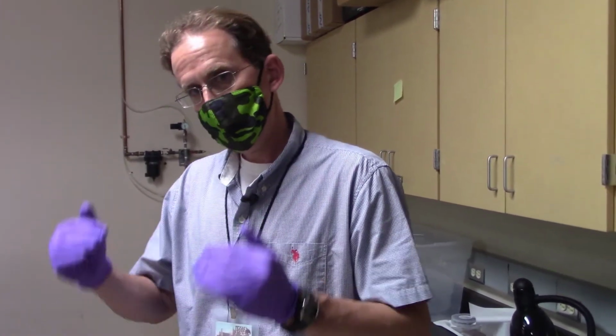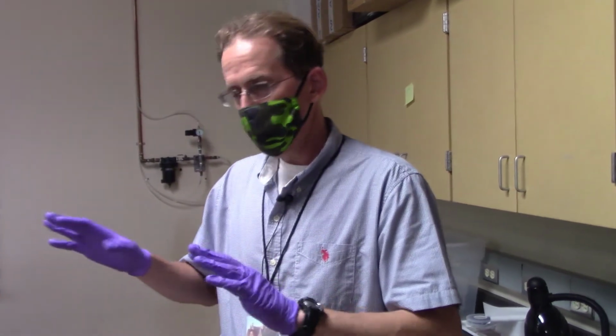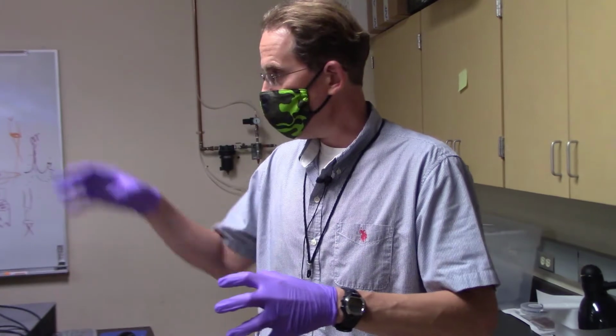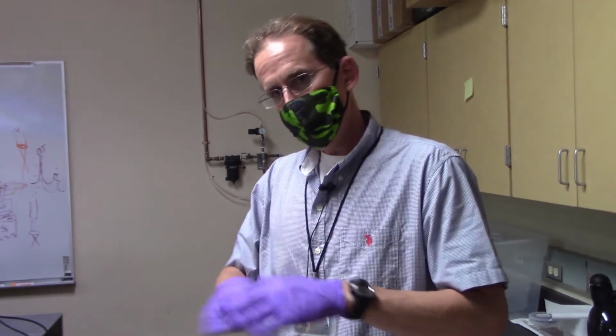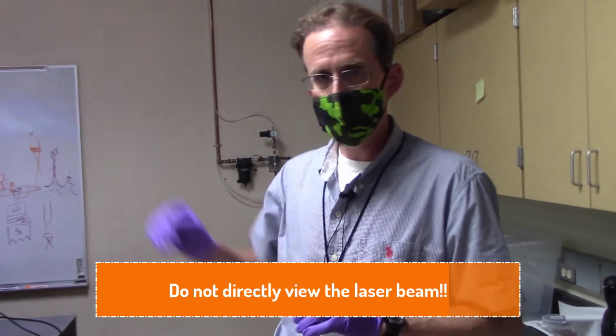As soon as you send them through microscope objectives, you're going to drop down the overall intensity compared to just at the exit aperture of the laser. So staying in an operational environment where you keep the laser light confined to the microscope optics is by far the smartest option, and that's exactly what this system does here. Under no circumstances should you ever attempt to view the laser beam or get inside the optical cavity.